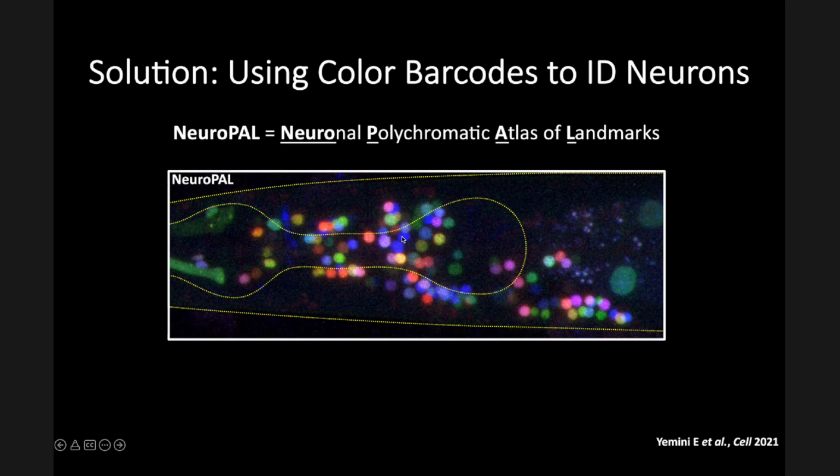So here, these are, once again, neurons, and these little colored dots are neurons. These are their nuclei, actually, these colored dots. They have the same color across all worms. So this is not a rainbow method. It's very, very different. It's not stochastic in that sense. It's entirely deterministic. Every worm here basically looks identical. We have one color map for them, and those colors stay the same from birth till the death of the worm, as far as we know. I haven't really looked at a worm right on its deathbed, but I've never seen these colors differ.